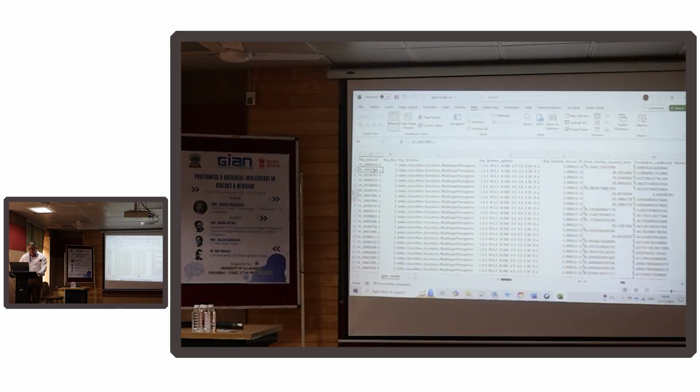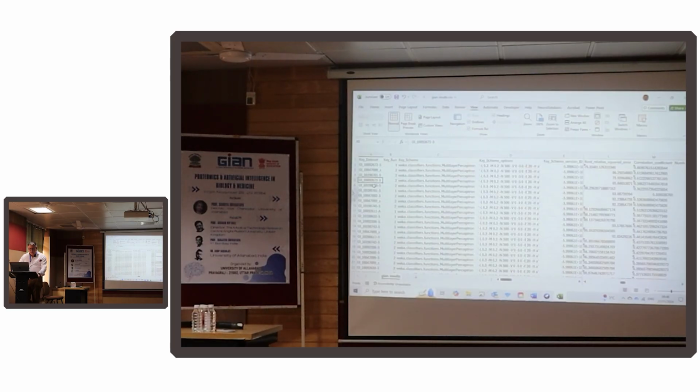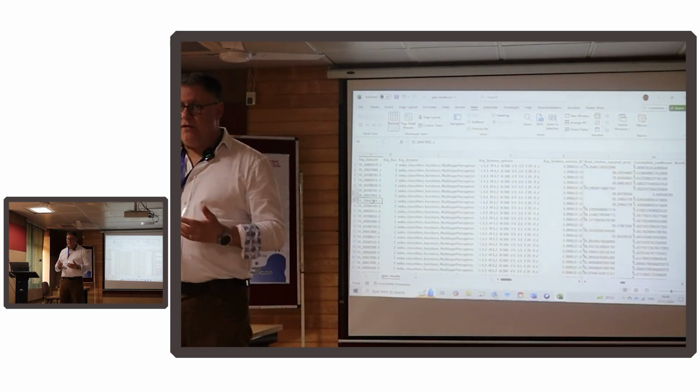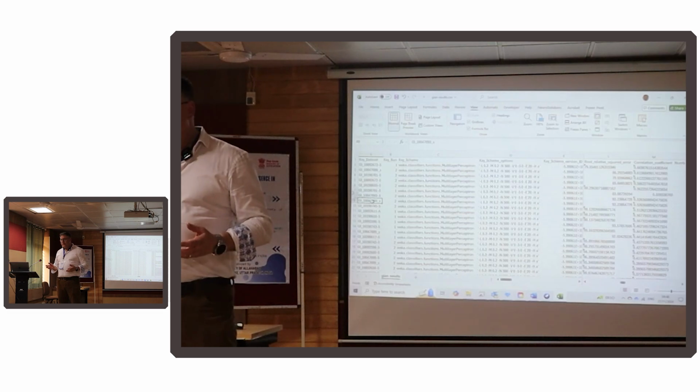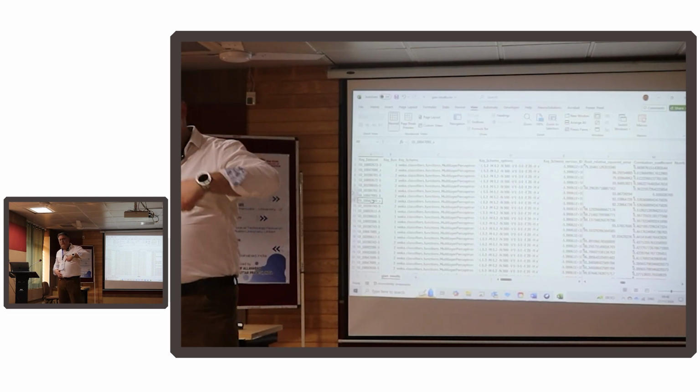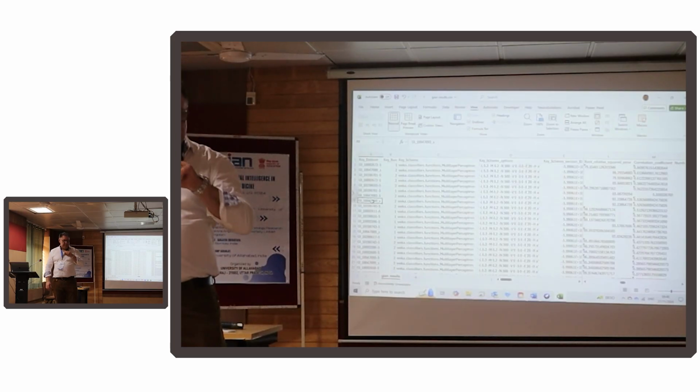You can see I have now, this one has then 1004, then 1019. Then I've got 1009 again, then 1019, then 1019, then 1004, then 1004. So you can see across the different instances, the same three genes are coming up as highly predictive of muscle age. So I put 50 in, and I can immediately see which ones are stably coming up.